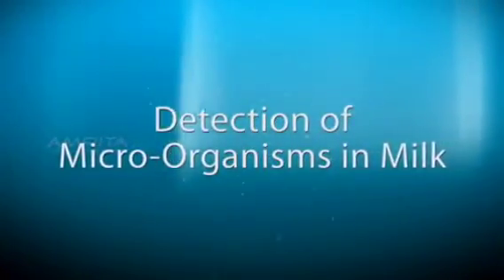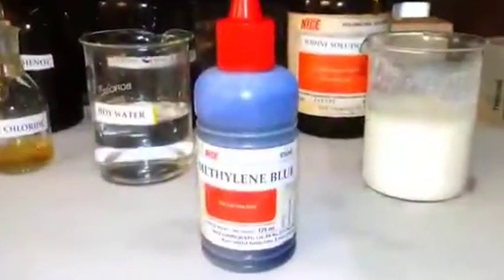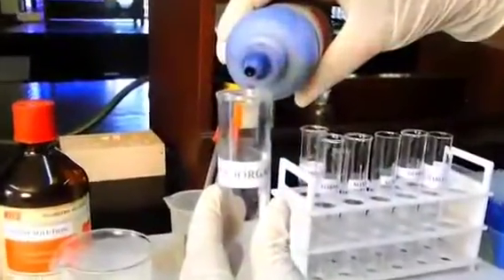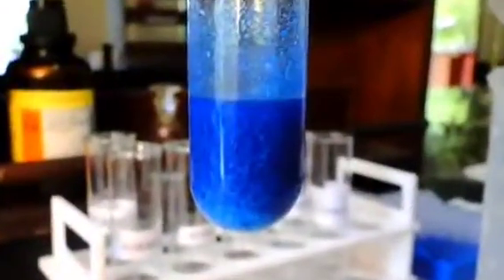Detection of microorganisms in milk. Pour 10 ml milk from the beaker into the test tube labeled microorganism. Add 8 to 10 drops of methylene blue into the test tube containing milk and mix the contents well. The color of the milk solution turns blue.